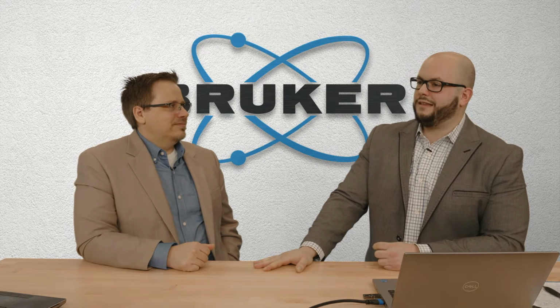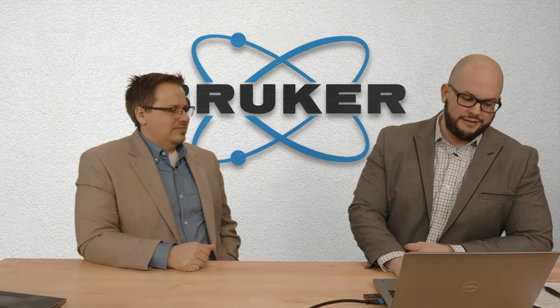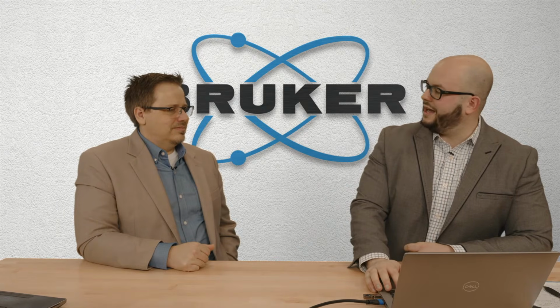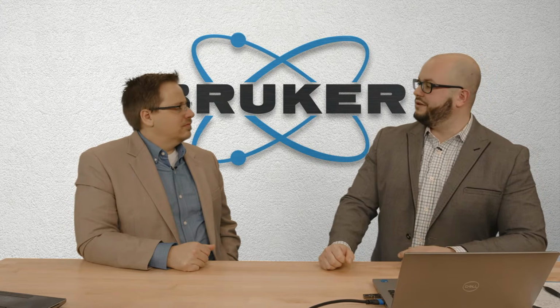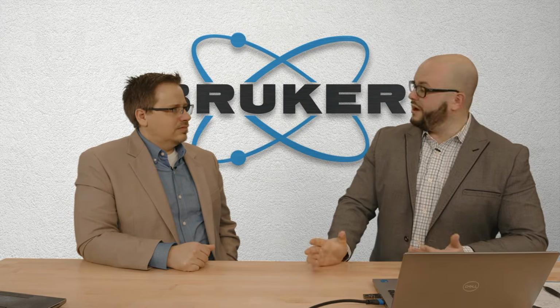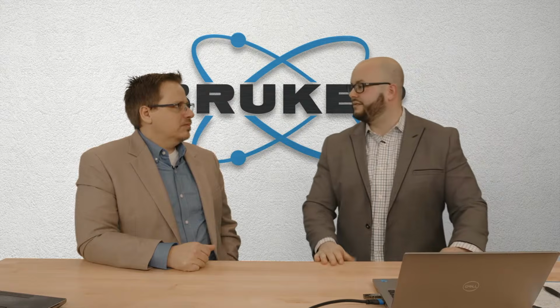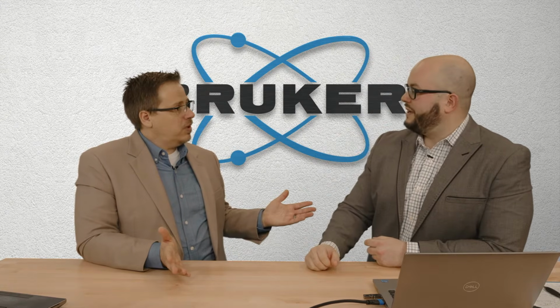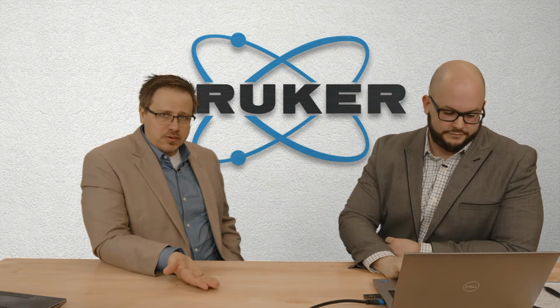Yeah. So I would cycle through all of the data like we did over here and just see exactly what's going on with my fit. Am I getting some abnormalities due to maybe some noise or something like that? Maybe my background isn't fitting properly, or I don't have enough background on both sides, right? Or you have peak convolution. You could have another peak going on in there. So one way to battle that would be to use the gravity or sliding gravity approach. Yep. Also, maybe find a different reflection. Yeah, that could also help in your measurement. Or make sure that you're measuring that higher angle reflection.